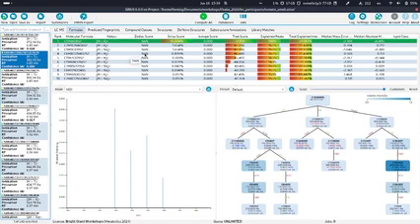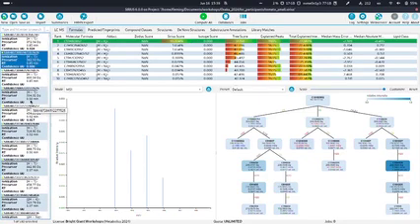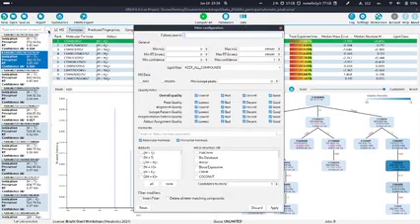Okay, but now we can see a lot more stuff. Before we go into the detail on all the views, let's apply a little bit of filtering, because you will see we have 530 features, and we will definitely not be able to go through all of these here, but also in most of your analysis, often it's a good idea to restrict what you have in your data even further, especially if you know exactly what you're looking for, or at least know a little bit of what you're looking for.